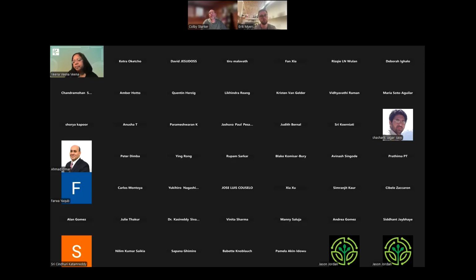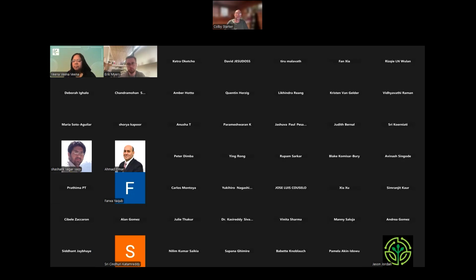So let's see. I'm trying to remember. We have a protocols paper on how to do that. I made a system that allows us to clone it. The actual design of the guide RNAs is really no different than designing a single guide. The cloning is a little bit more complicated. There is a protocols paper. The first author is John Cody out of our lab. It's a Nature Protocols paper, and I think it's buried in there, since it's not the focus of the main paper. All those reagents are available at Addgene, so if you're interested in that, I would say look there. But the actual guide design is really not any different.